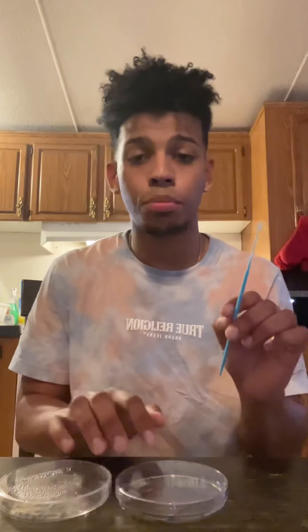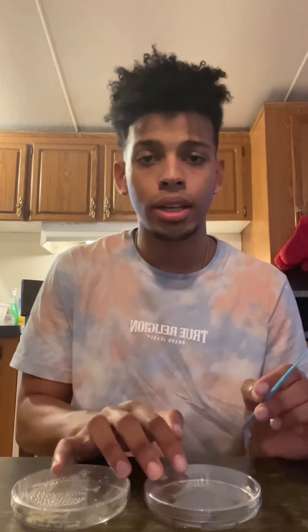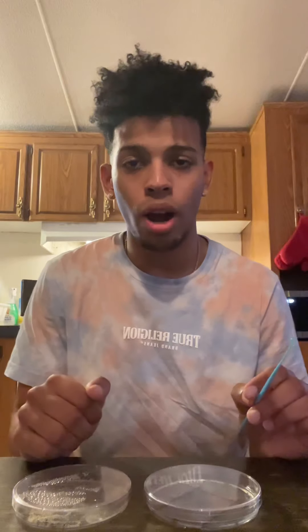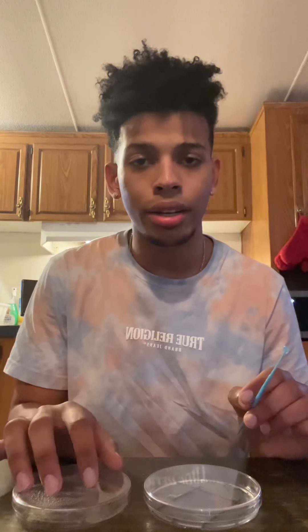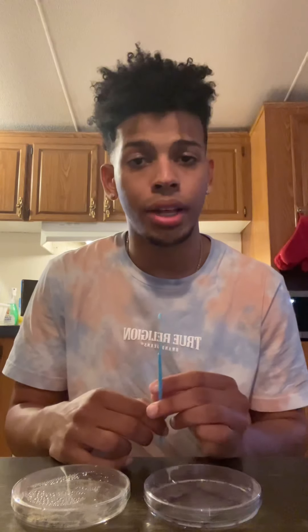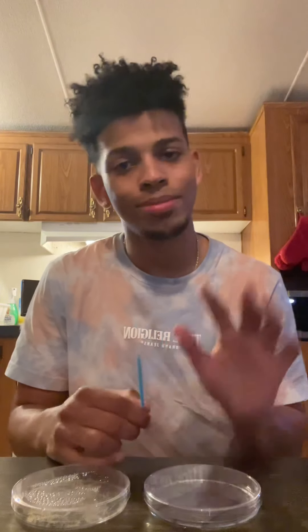Now I'm going to dispose of this properly by leaving it in bleach for 24 hours and then throwing it out. Same with this colony after we're done, and we'll see our results in about a day or two after incubating. Thank you.